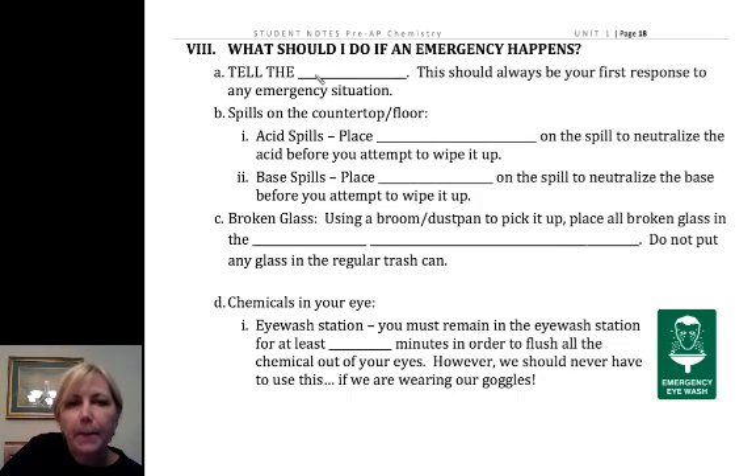Let's look at what we do in an emergency. If there's an emergency, the first thing you want to do is tell the teacher. If it's something very straightforward, or you think you've got to get to the eyewash, you want to get moving too, but call the teacher over ASAP.